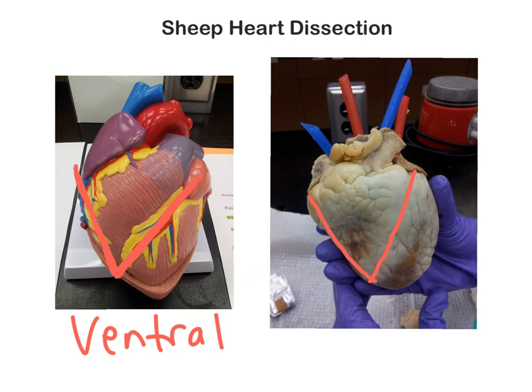Another key point is, if we look right here, that is the main branch coming off the heart — that is the pulmonary trunk, and you can quite easily see it right here too. That's always going to be leading from the anterior or the ventral surface.